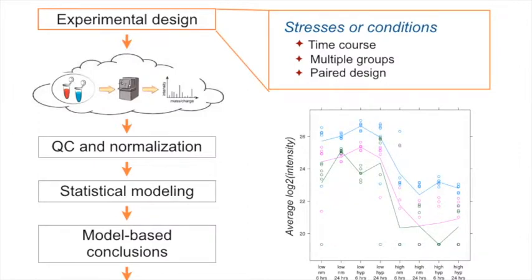Okay, but let me now tell you about the steps that we have to perform and the philosophy behind that. The whole workflow, in a very general way, is this. And this really is not very specific to mass spectrometry or proteomics. If you have worked with genomic data sets or metabolomic data sets or anything, this is what we would do, right? And by now, I hope, if you were here last week, you know that the first thing we need to do is to design the experiment, and we need to talk to a statistician before collecting the data, right?